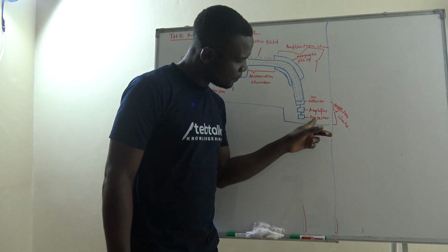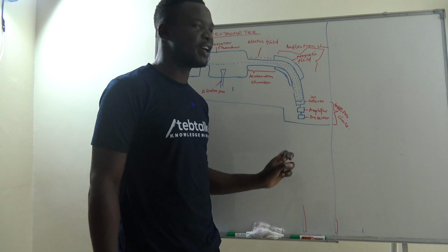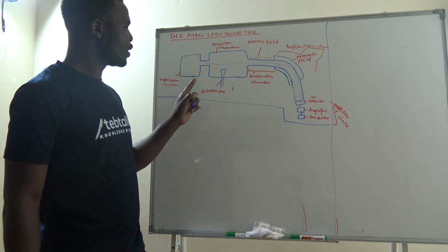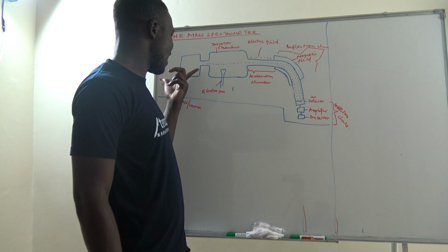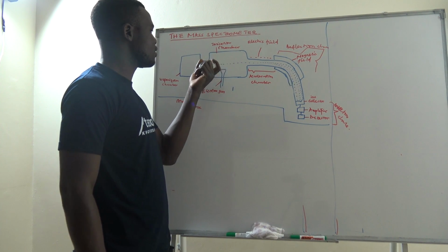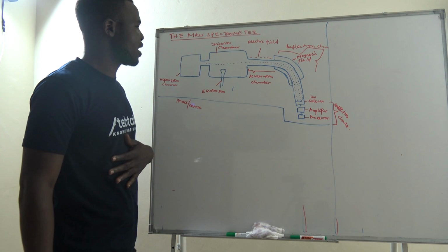Now, the graph that is drawn on the screen has a series of peaks. Those peaks on the graph correspond to the molecular ions that were in this sample, because when the sample is vaporized and then ionized, it forms fragments, the fragments that make up the sample.